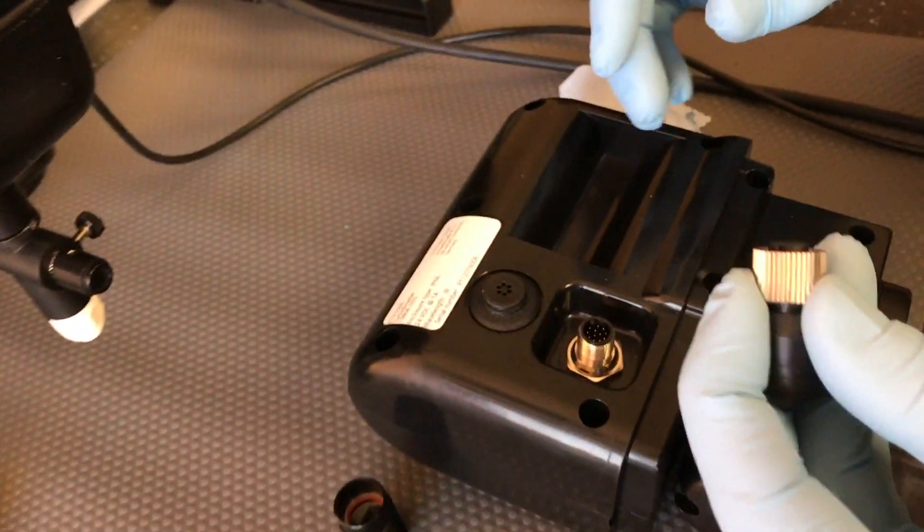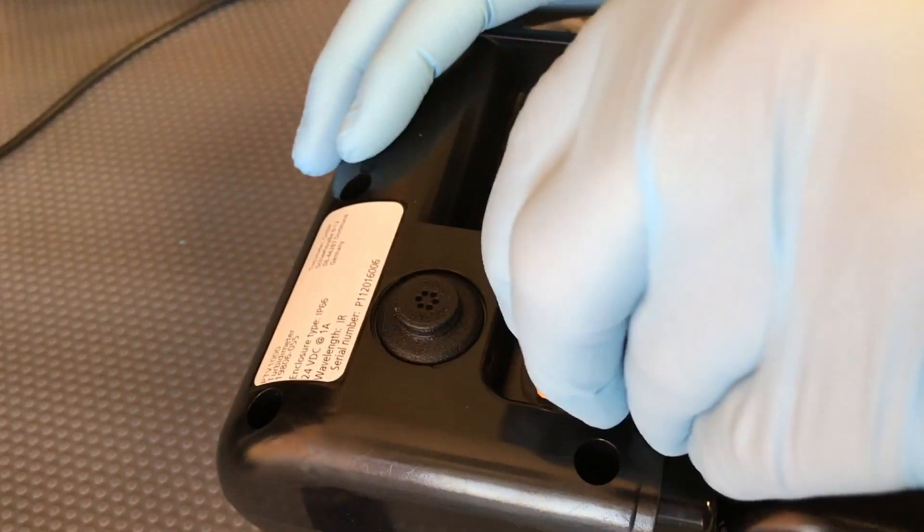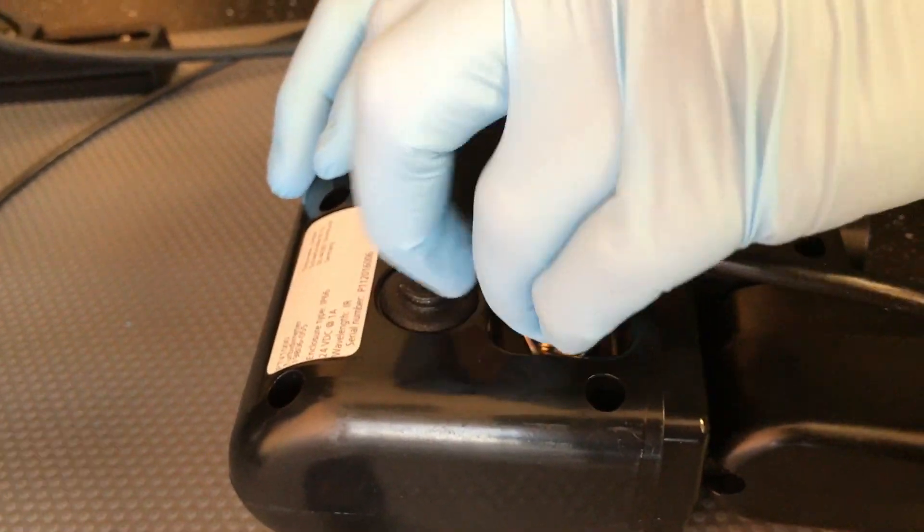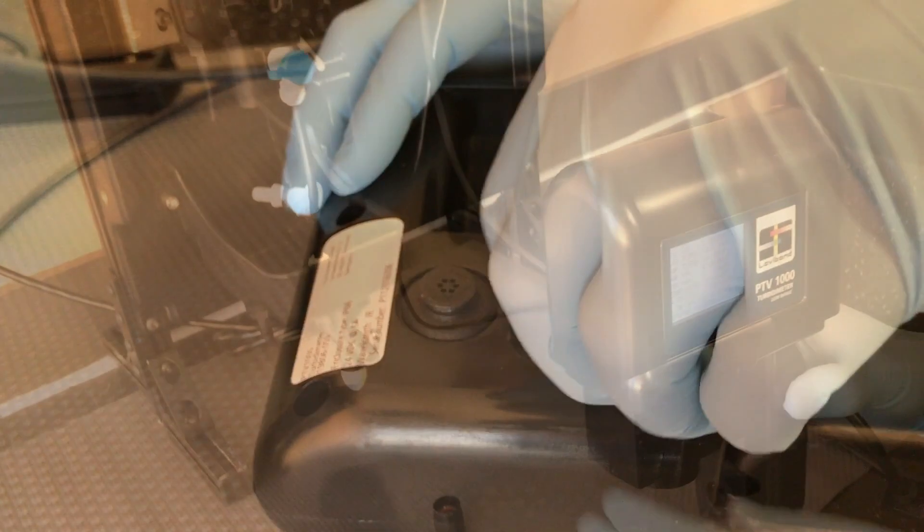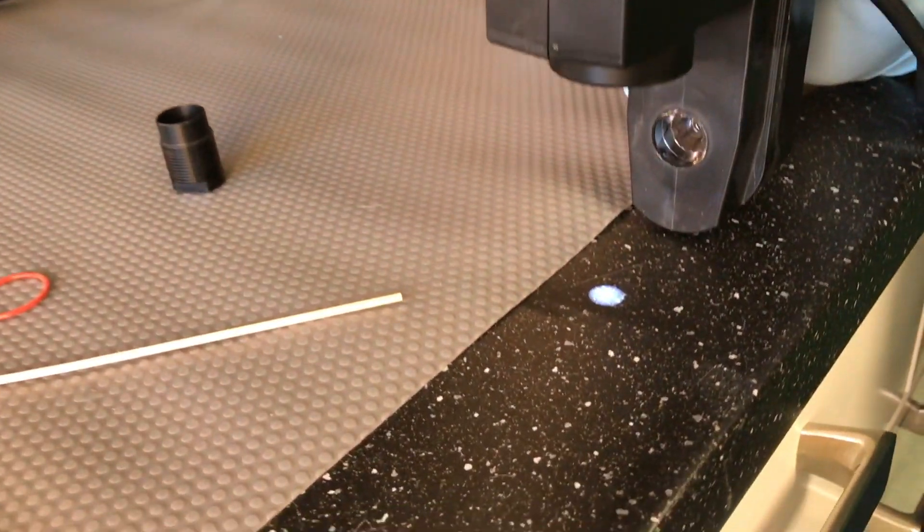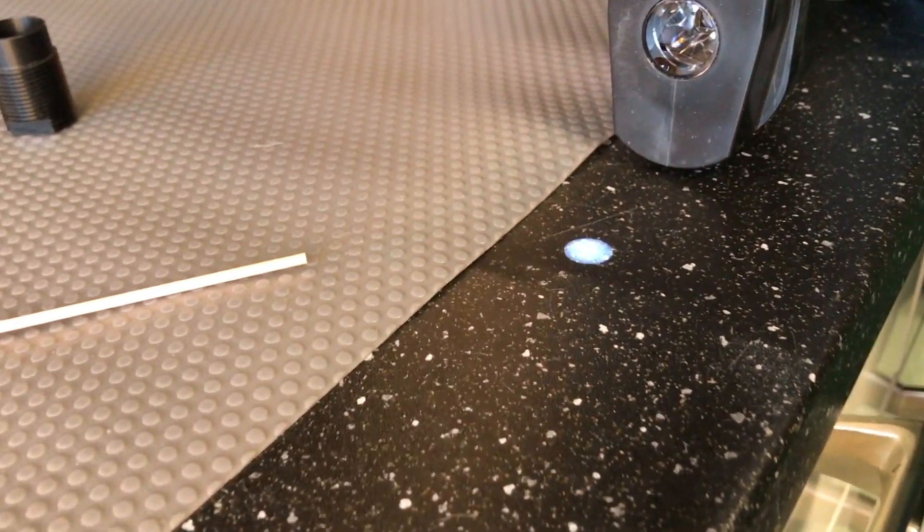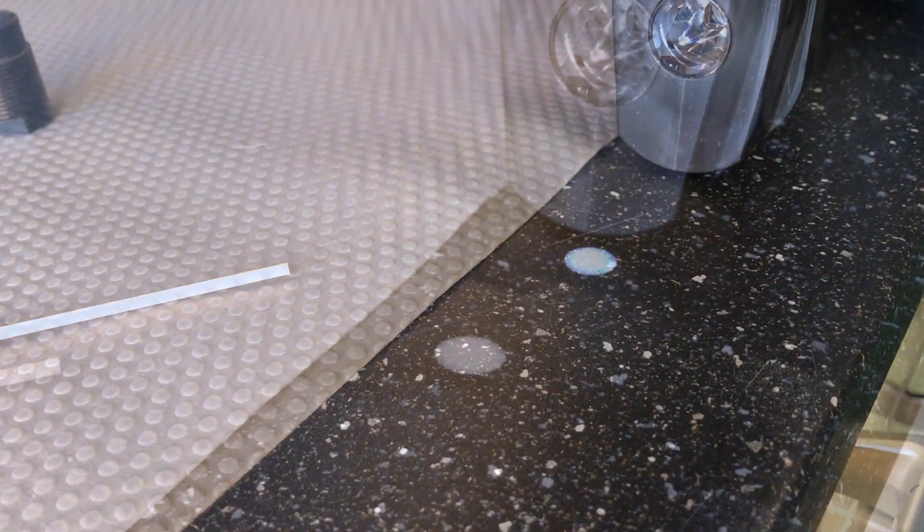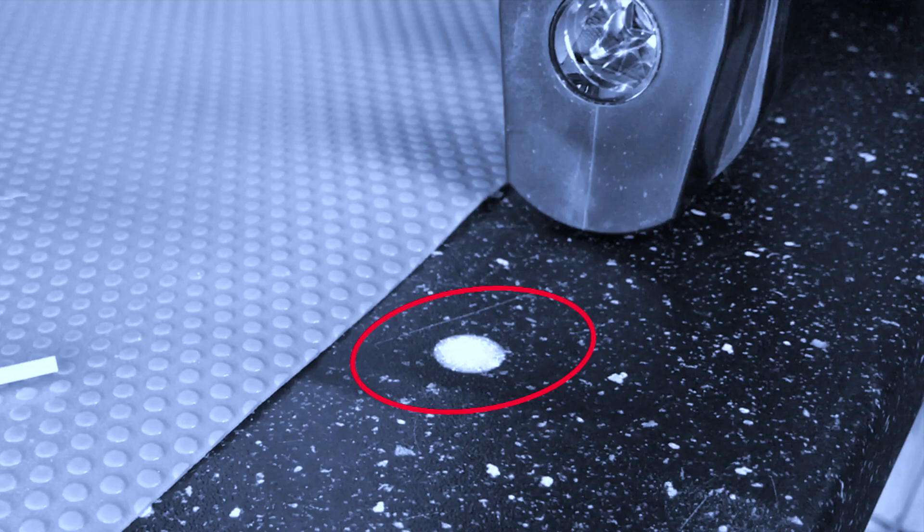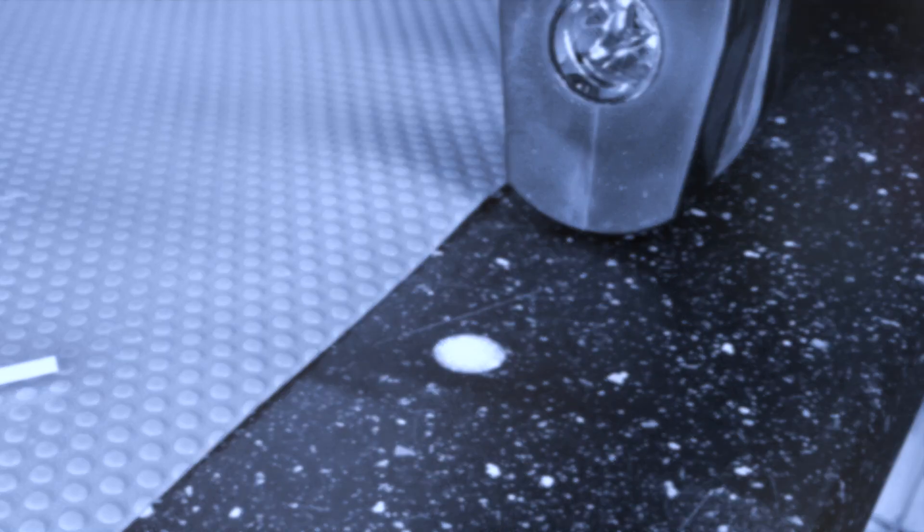Reattach power to the module and ensure that all prongs seat properly. Hold the module so that the beam shines onto a flat surface and inspect the beam to ensure it is round and there are no irregularities.